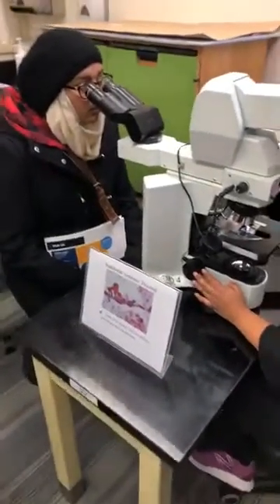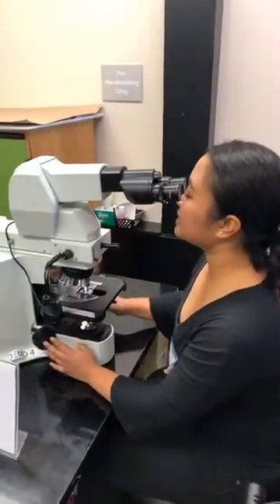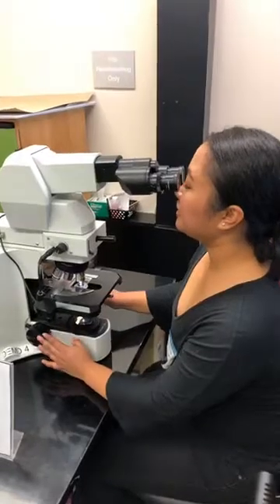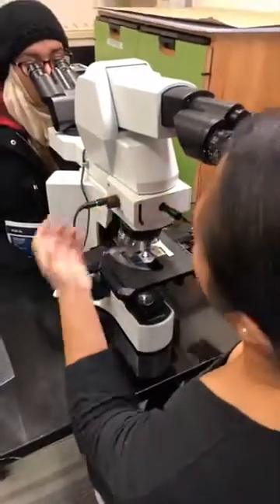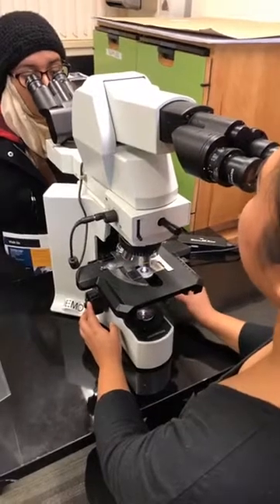And the unique feature of this is, if I'm the professor, I get to drive it, moving from side to side and around everywhere. There's also a pointer, like an arrow, where I can point at a specific part of a cell. And I think this is a thyroid.